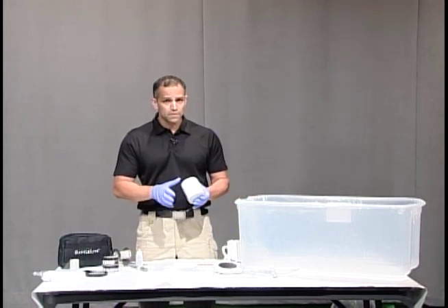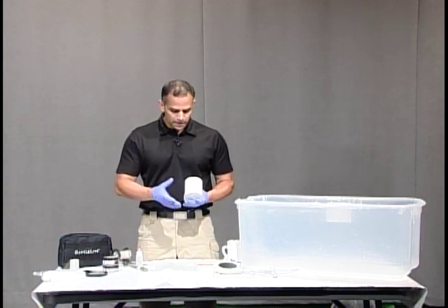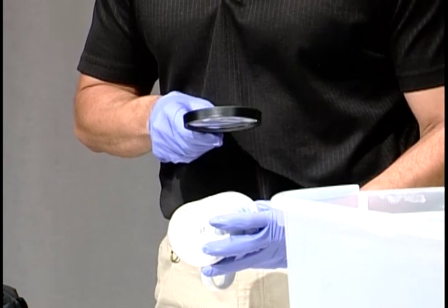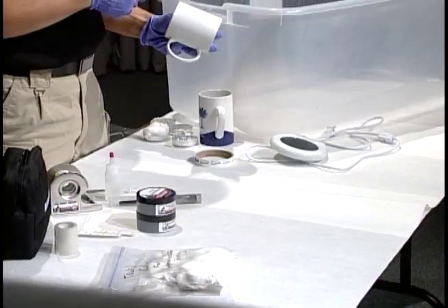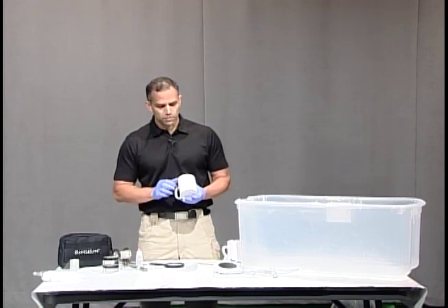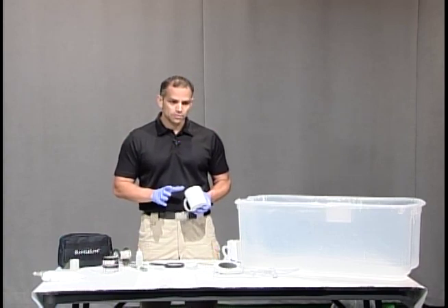Here's a mug that I put a fingerprint on for practice. Now if we're looking at this and we use our magnifying glass, we're not going to see any fingerprints on here. But that doesn't mean that there aren't fingerprints on here. So we're going to super glue fume it and then we're going to dust it for fingerprints and see what we have.